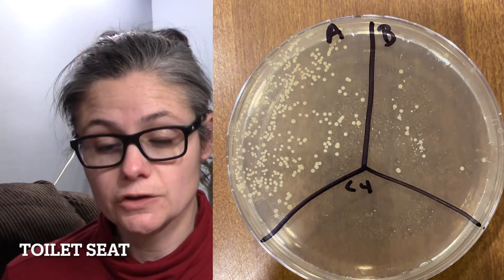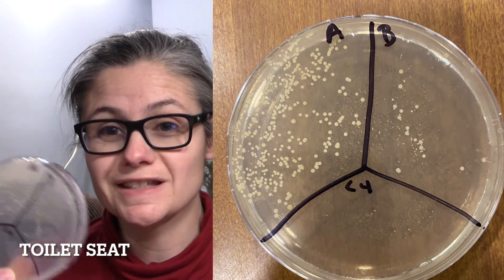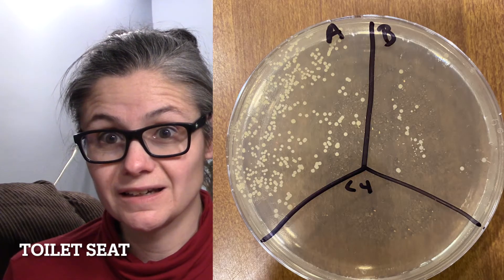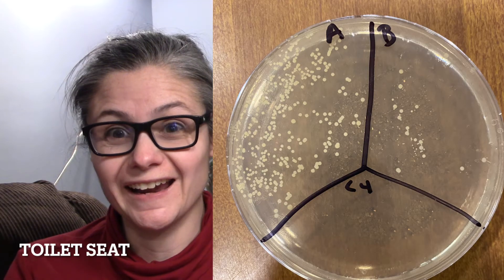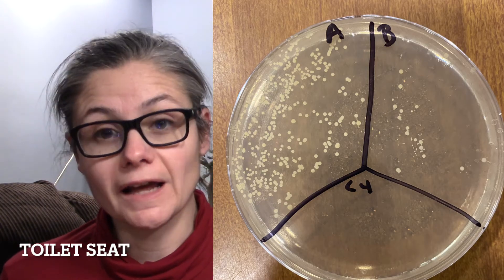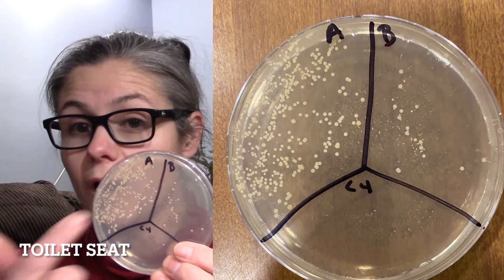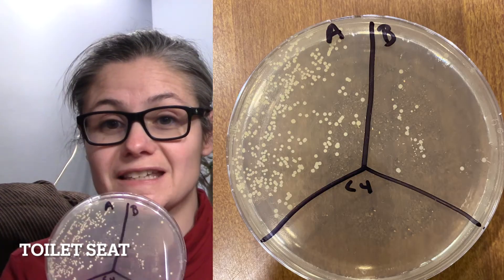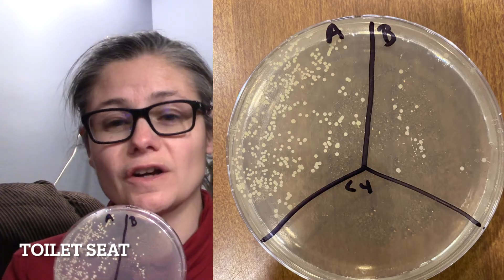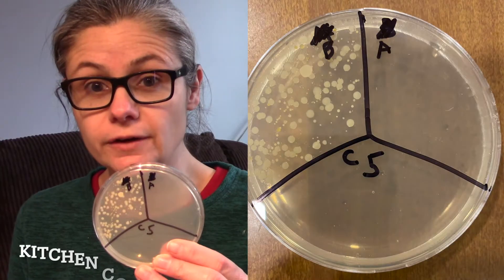The toilet seat — specifically the underside. We had some sort of mishap here: our B for before has fewer bacterial colonies than our A for after. I don't want to count this one when assessing Dr. Bronner's effectiveness, because clearly I made a mistake in swabbing or didn't clean the same area I swabbed. So let's disregard this one.